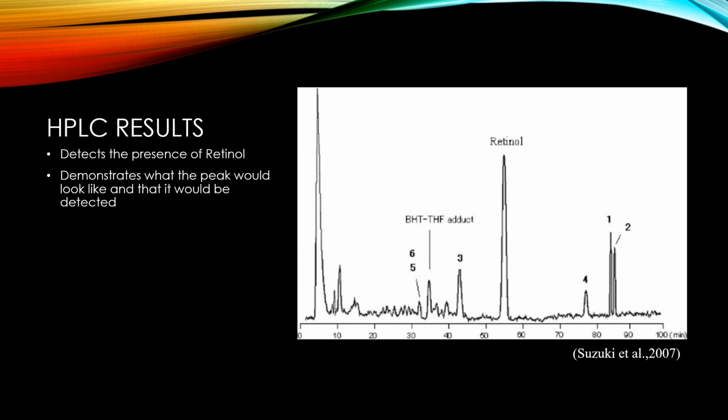So this chromatogram does show the presence of retinol. It demonstrates what the peak would look like if this was done, as well as how it would be detected. So this is very important for this analysis, because it shows what I would find if this was done properly.